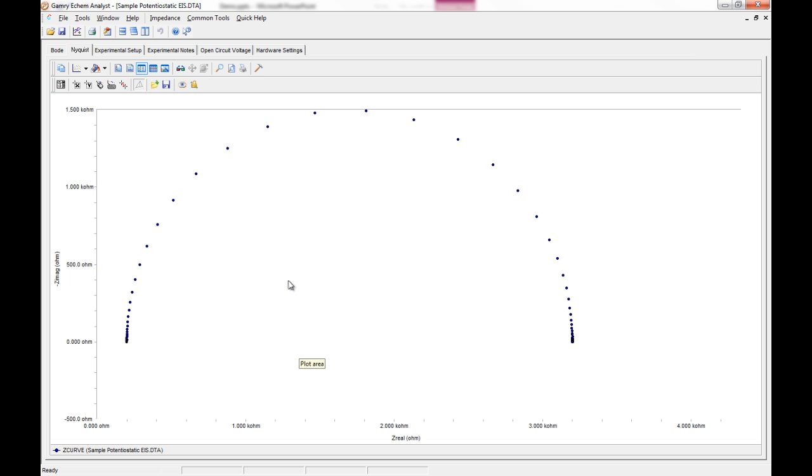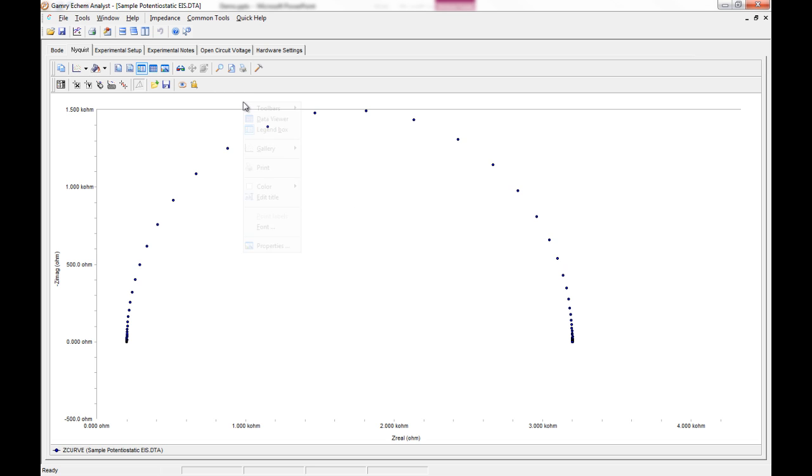There's another neat feature of Ecamm Analyst that I want to show you regarding exporting of charts. And that's the ability to add, say, a picture to your chart for exporting. So perhaps what I would want to do is I would want to put the model actually on the chart itself.